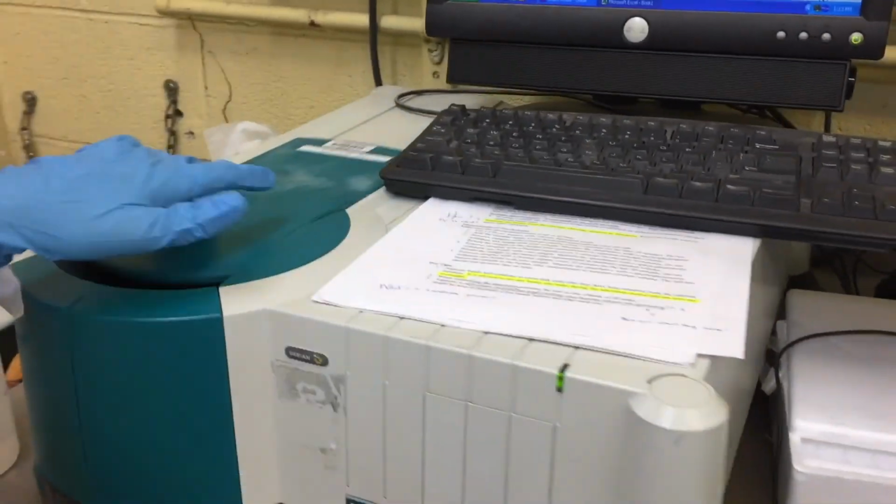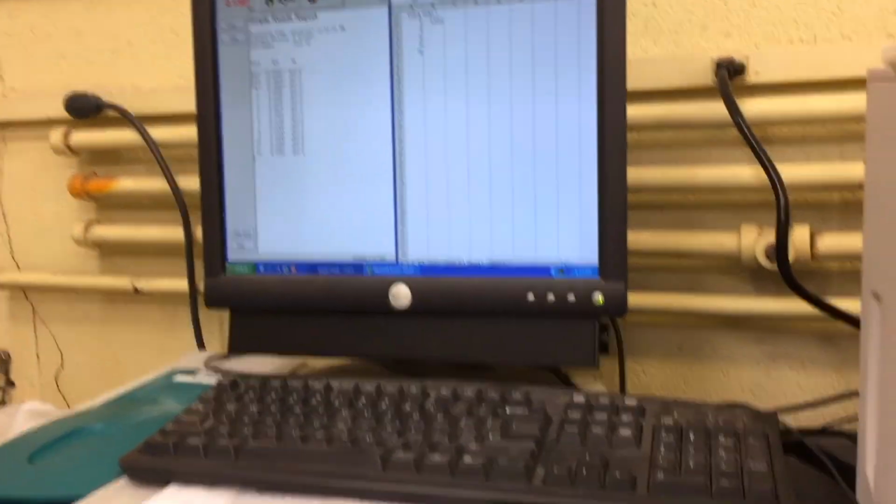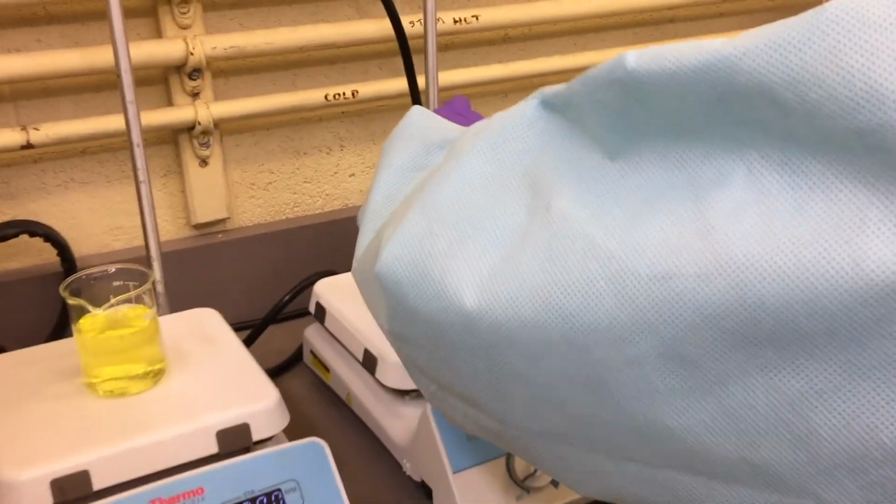3 tests were done for each of the variable changes, and the data was recorded. The solution of the cuvette was then returned into the beaker that it was taken from. These measurement steps were repeated again until all of the tests were done.